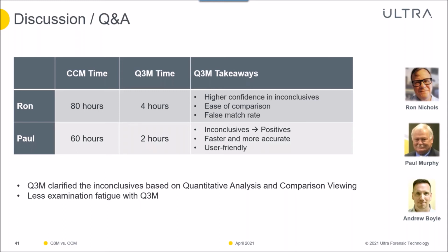Okay. And Paul, where do you see the biggest hurdles in adapting 3D microscopy? I would say we have to convince the courts. The community will have to meet up with prosecutors, judges. We have to introduce the technology to them and then show them the value of the technology. And once the court accepts this, I think we'll be good to go with this.